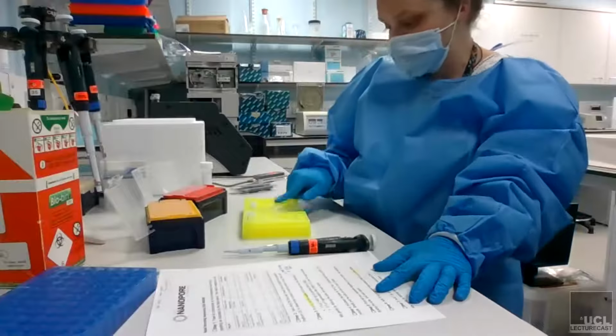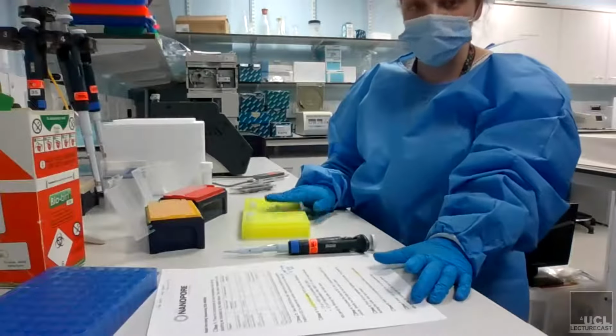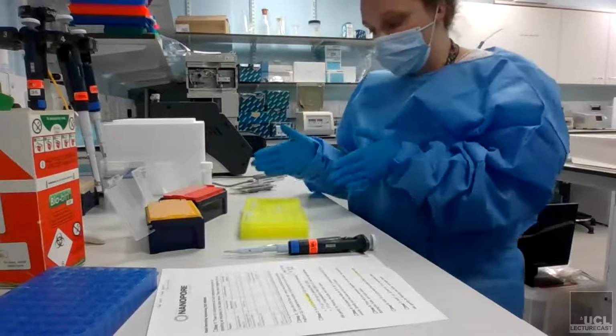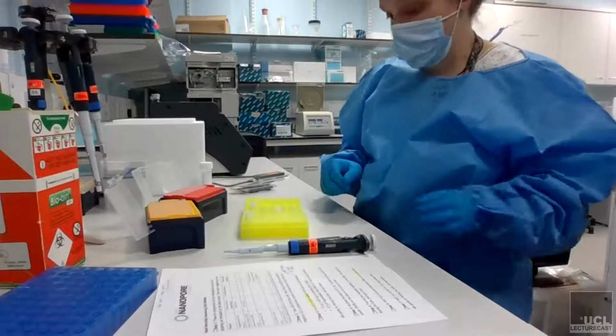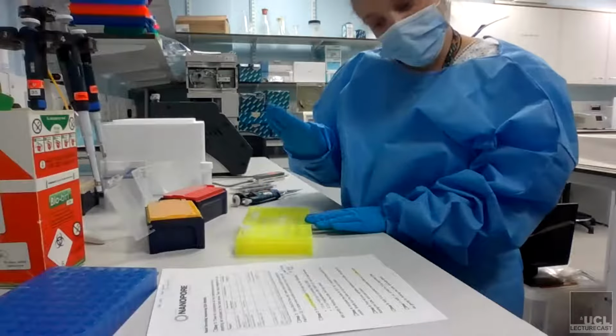Now we've got all of our samples, and they've been properly tagged with our barcodes. The barcodes are small sections of DNA that have a certain sequence for each barcode. When they go through the pores, the computer will identify which one is which, and that's how it knows which sample is attached to which barcode.